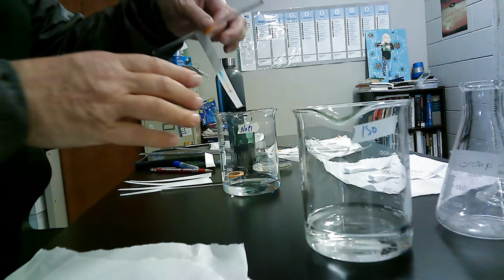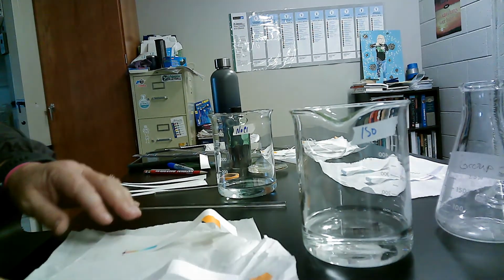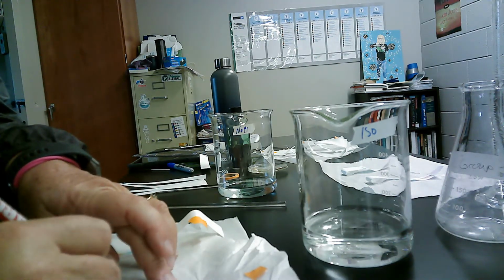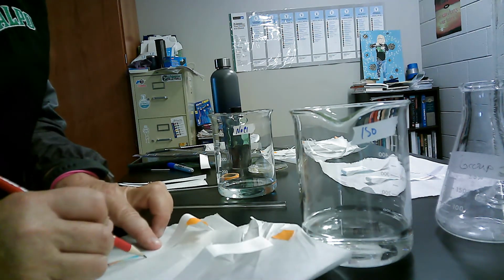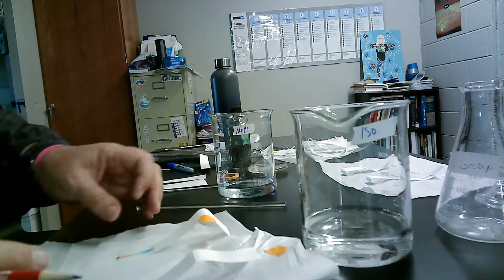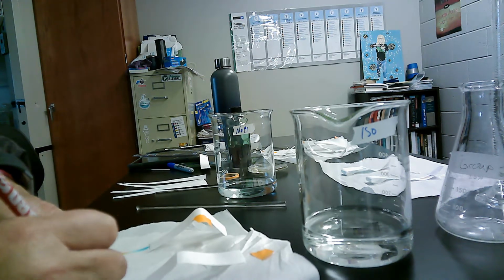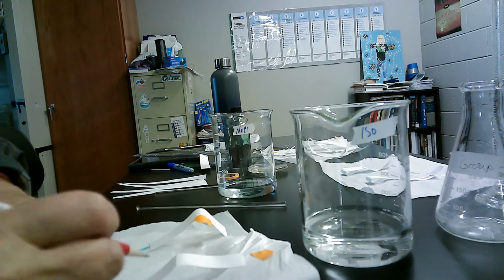So I'm going to take them out, lay them on this paper towel, and now I'm going to mark a couple things. I'm going to mark where my solvent front was, because I'm going to need that, so you can see that I marked those. Then I'm going to need to mark my colors. So here I can see this one. It's hard when they're wet, but even if you go back to it later on, you want to get some kind of outline there before they start blending in.